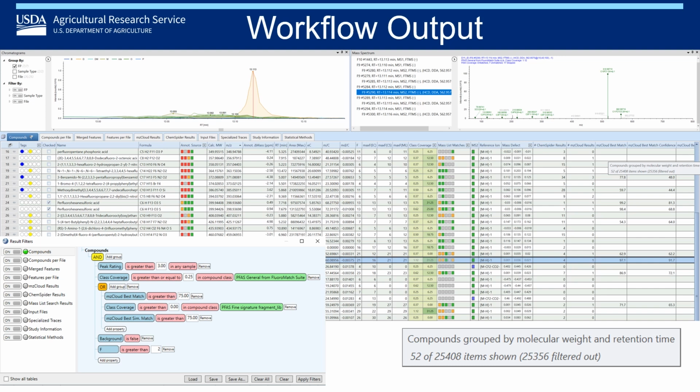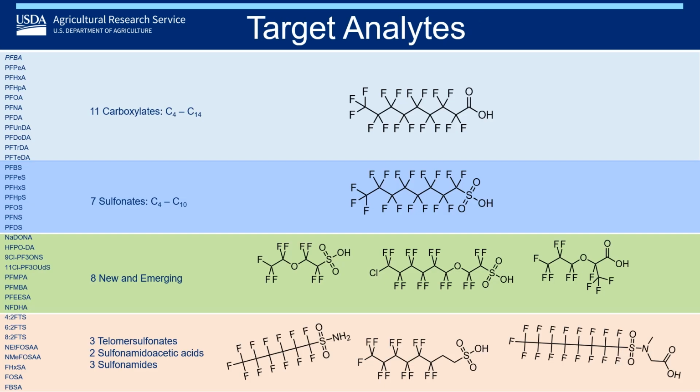So designing and testing workflows and filters to be able to identify PFAS is extremely important in the field. We went about this by spiking samples with the 34 targeted analytes that Yelena used in the work previous, and this was useful because, as you can see, many of these analytes have slightly different physiochemical properties as well as structures.